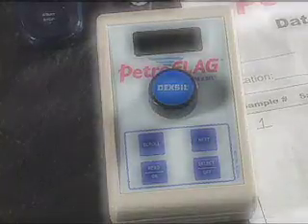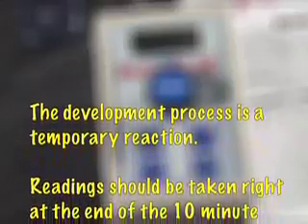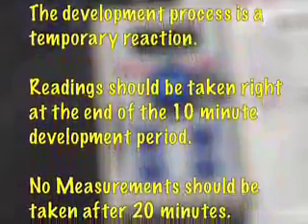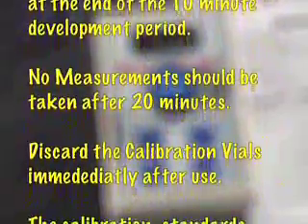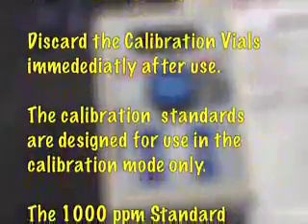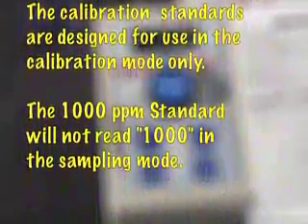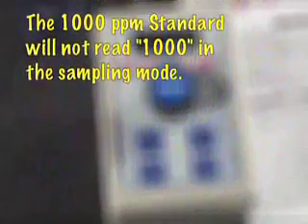Important. The development process is a temporary reaction. Readings should be taken right at the end of the 10-minute development period. No measurement should be taken after 20 minutes. Discard the calibration vials immediately after use. The calibration standards are designed for use in the calibration mode only. The 1,000 parts per million standard will not read 1,000 in the sampling mode.